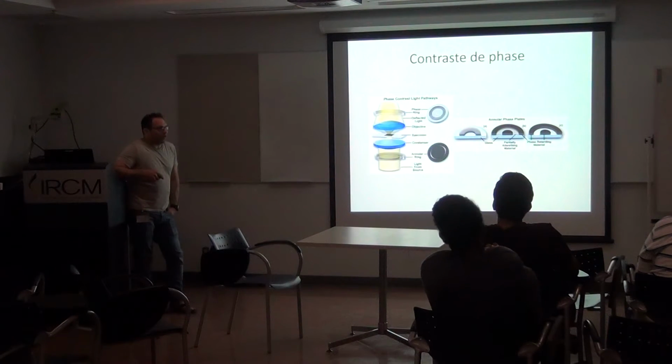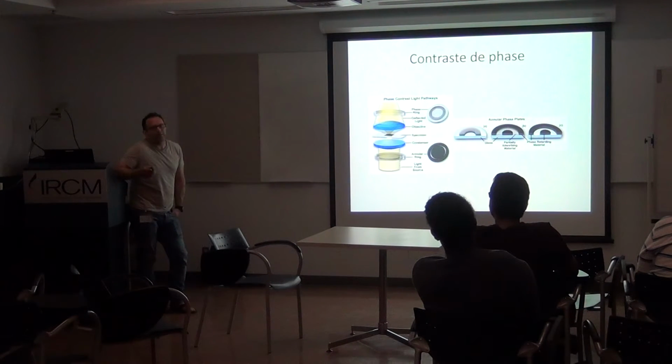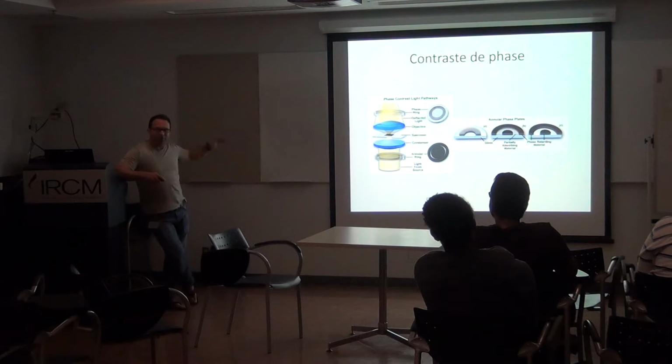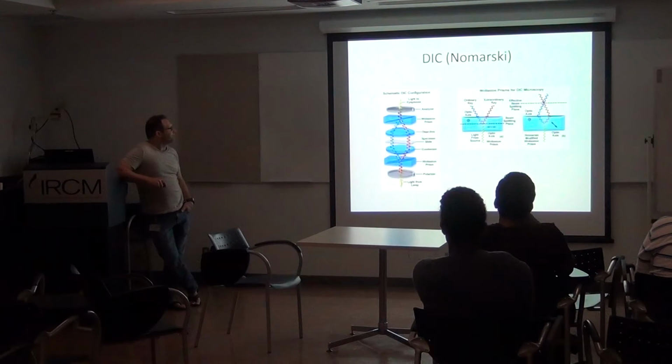Okay, so this is how you can really achieve phase contrast. If you don't have that, we're not talking about phase contrast, we're talking about another contrast method in bright field. I don't know which one, but it's not phase if you don't have a ring like that, and the specific objective which has the same size that fits this ring, then it's really phase contrast.